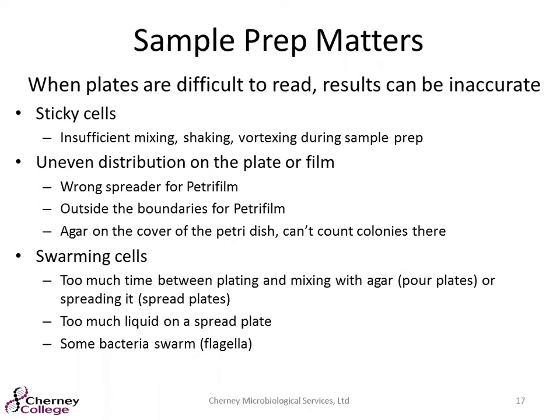And then another thing, not stacking those Petrifilm too quickly. They need a good 1 to 2 minutes for that gel to form and to solidify before you move them. So that can also create a different boundary line than what you're used to.